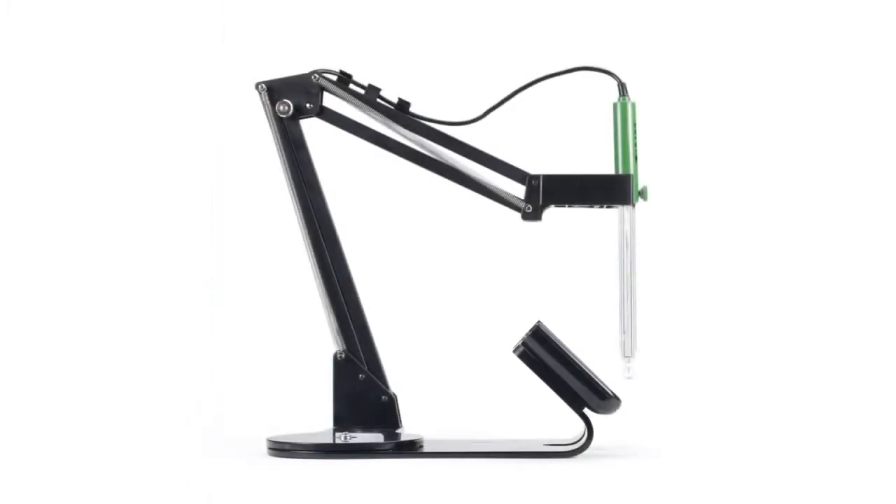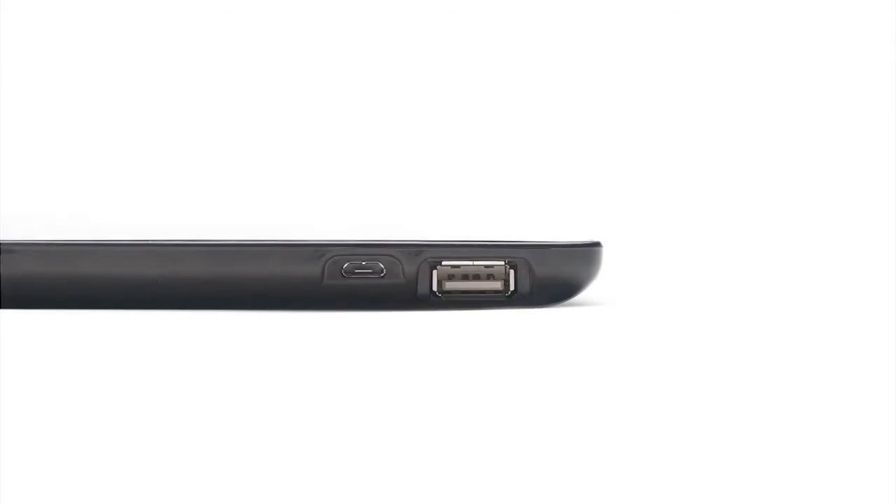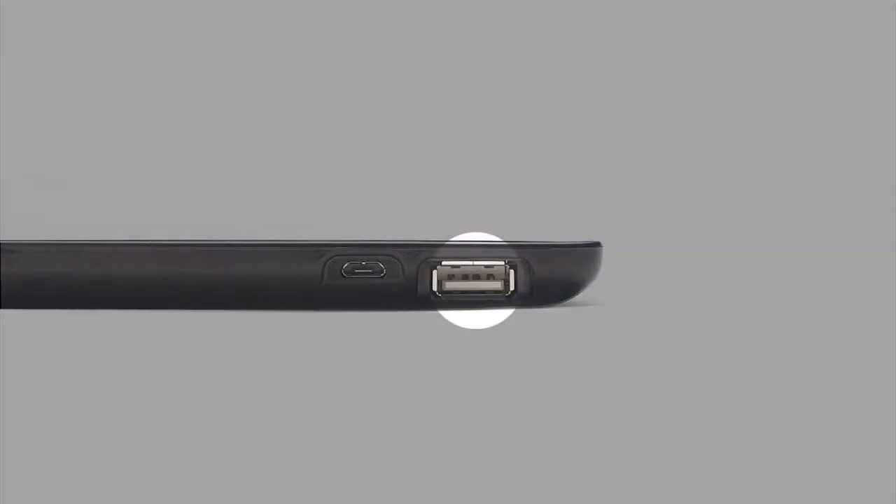Its benchtop cradle is equipped with an adjustable swivel electrode holder to charge and hold EDGE securely in place at the optimum viewing angle. It has two USB ports: one standard USB for exporting data with a flash drive, and one micro USB port for connecting to a computer for file export and for charging your EDGE when the cradle is not available.